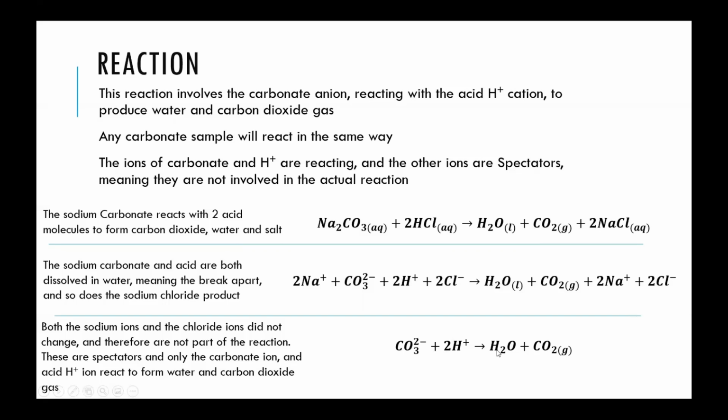Many times in chemical reactions, when you're trying to look at one component, that can't really be measured directly. You need to perform some sort of reaction on it in order to directly measure one of the products and then work your way back through the chemistry to figure out what that initial thing is that you're trying to look at. That's the case in this reaction.